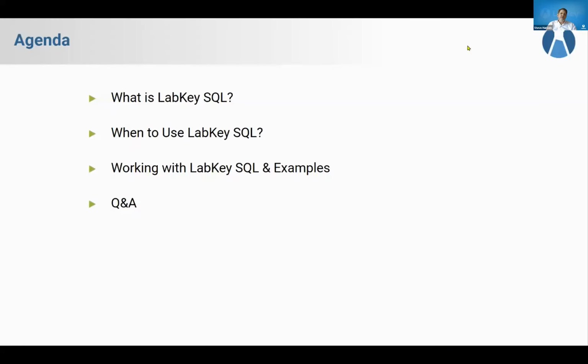So I really just want to touch on a couple of items today. First, what is LabKey SQL? How do you understand it? What's its role in the server, and what's it capable of doing? Second, let's take a look at some use cases and when it's really appropriate to use LabKey SQL. When is it best used for your data?